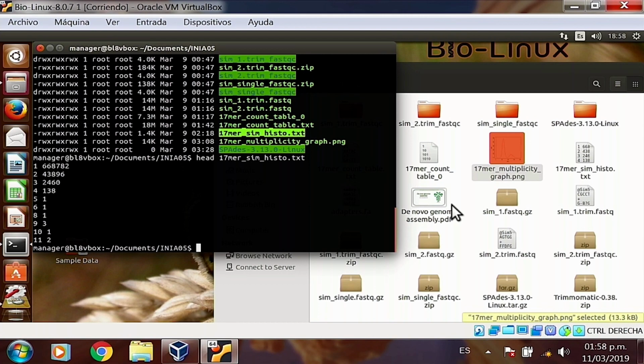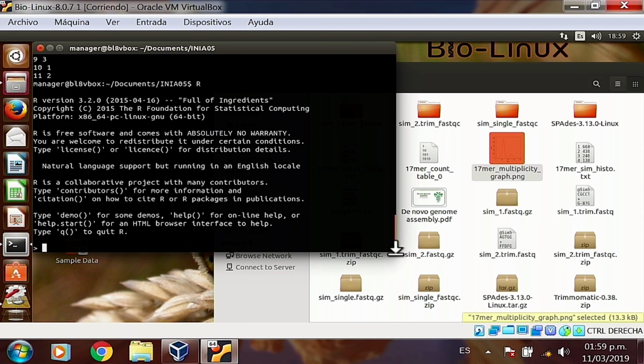So now we want to see that, because reading this is not really useful. We need to plot it and see if we can make more sense of it by plotting it. And that's the next step we did. We use R. Do you remember, guys, that we used R? Yes. And in R, what we did was we imported this document and we simply plotted. And after plotting it, we started playing around with which were the right dimensions to show so that the plot made sense.